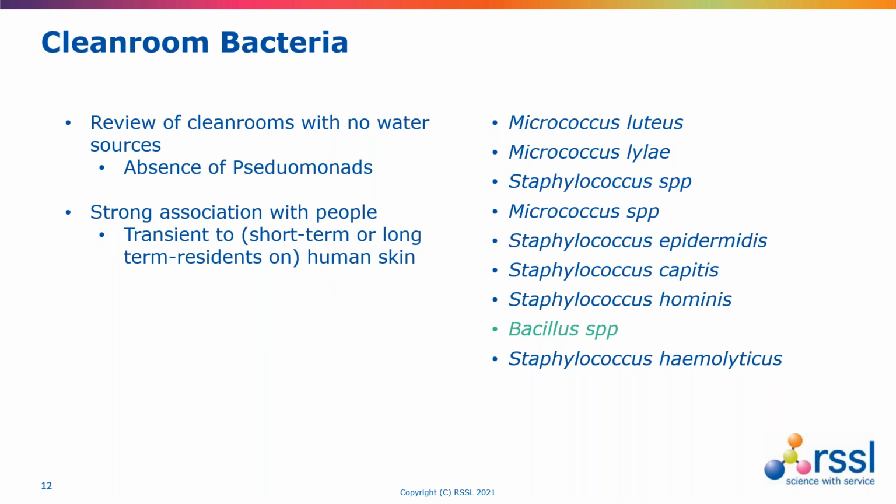This comes down to the different designs of clean rooms, different processes, different ways of getting things in and out. That's reflected in the Annex 1 upgrade, where it particularly emphasizes transfer of materials, and the associated transfer disinfection is probably representing the biggest risk area as you move through the clean room cascade.